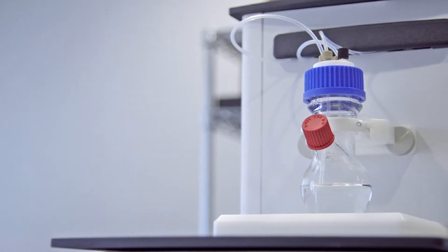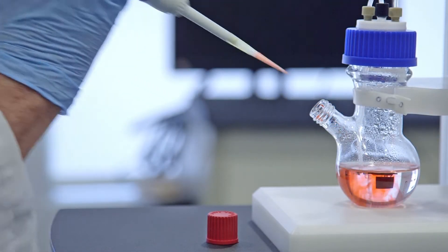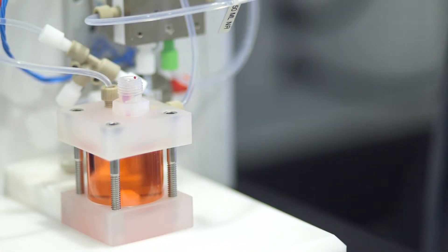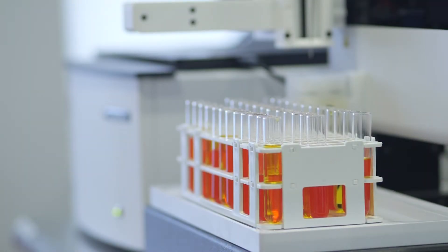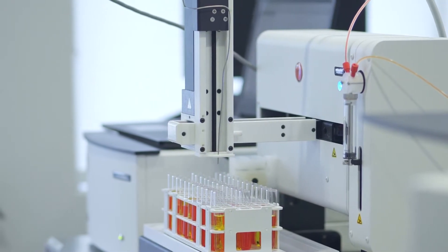The AccuSizer AD provides automated single-stage exponential dilution for concentrated samples. The AccuSizer APS uses two-stage dilution for highly concentrated samples, such as high concentration emulsions. All of the AccuSizer systems can be integrated with the auto-sampler for high throughput particle size analysis.